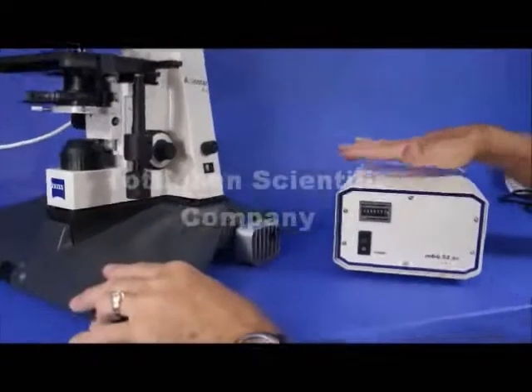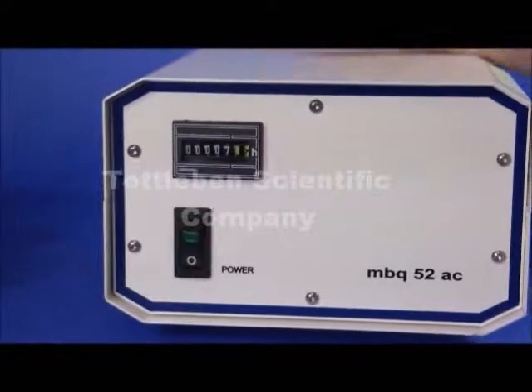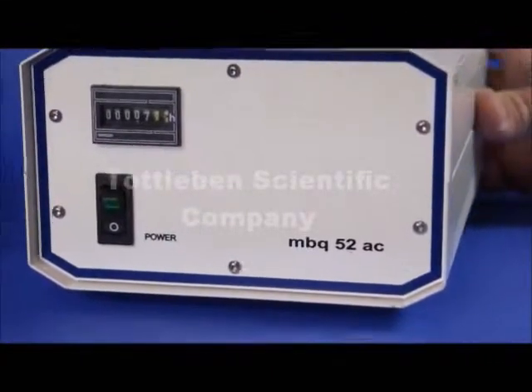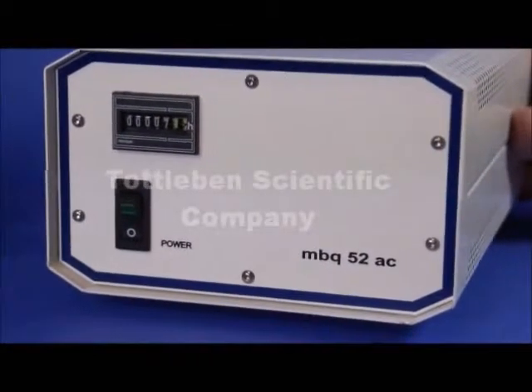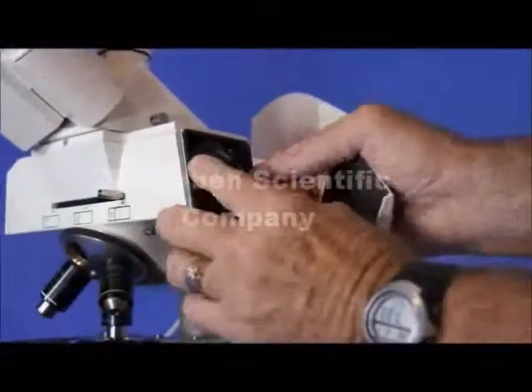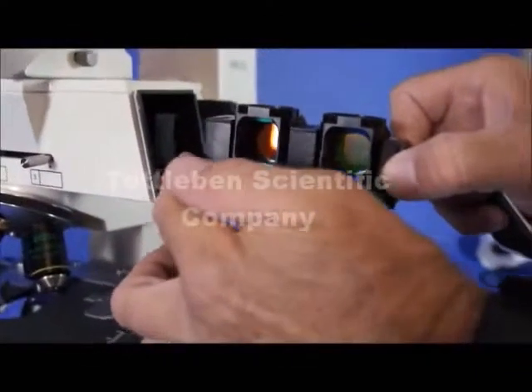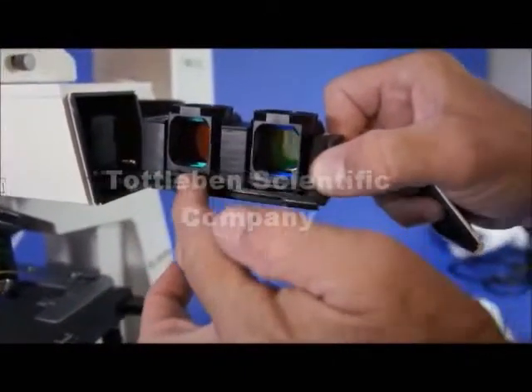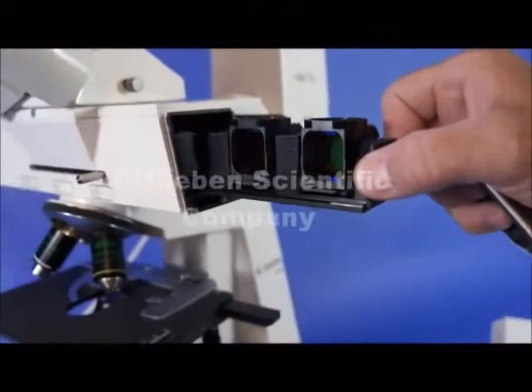Over here you have a 50 watt MBQ AC transformer for the fluorescence illuminator — it's a very powerful unit, practically brand new with only seven hours on it. Up here I want to show you the filter set and the slider for the different filters. You just simply turn the knob and you can slide the filters out. The far left position is blank — that would be the position you use for bright field — and then you have a rhodamine filter and an FITC filter for FITC, which is fluorescein isothiocyanate.